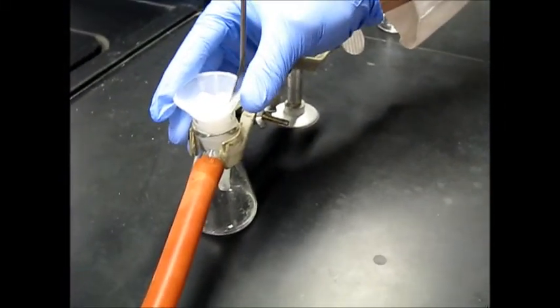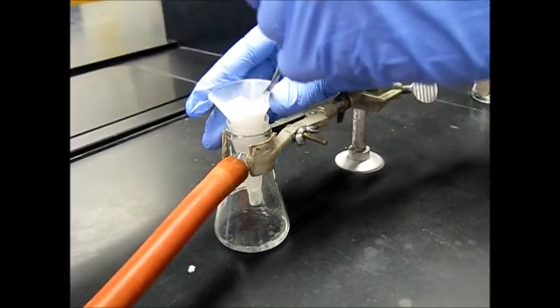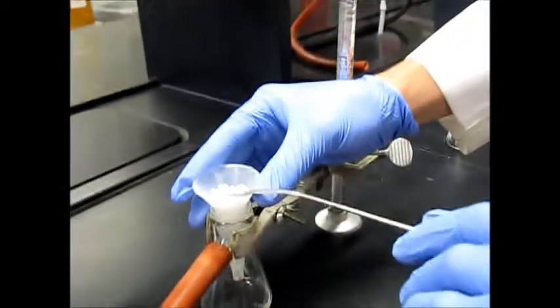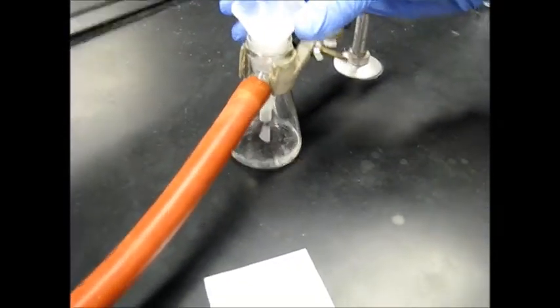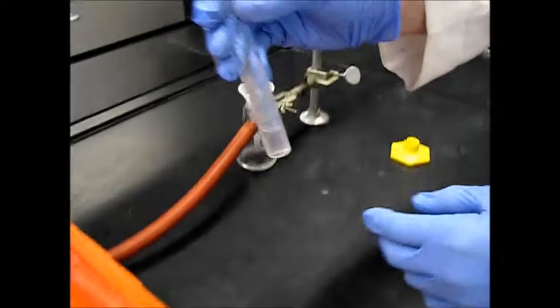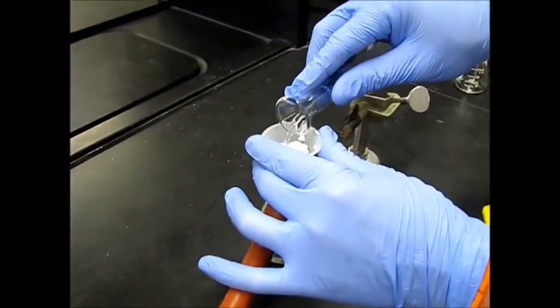Once it's sat under vacuum for about 2 more minutes, we'll add that 2 milliliters of cold methanol to really help it rinse. So we've let it air dry just under vacuum for around 2 or 3 minutes. This is that last little step before we finish out for the actual measurement of our product. So we're just going to add this 2 mils of methanol just to get that last rinse.